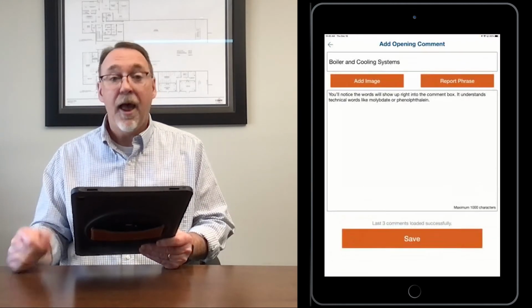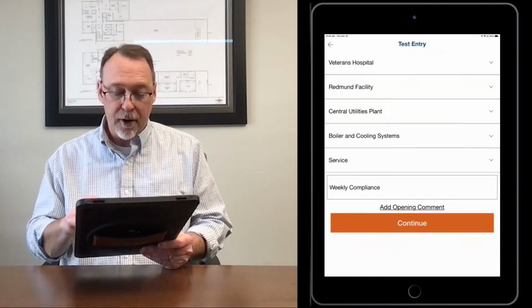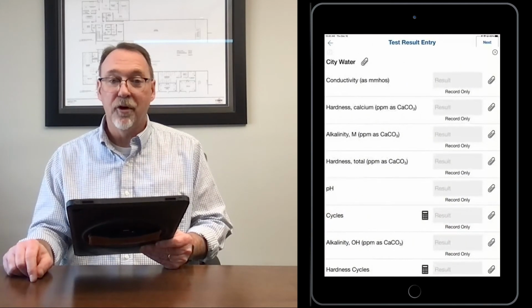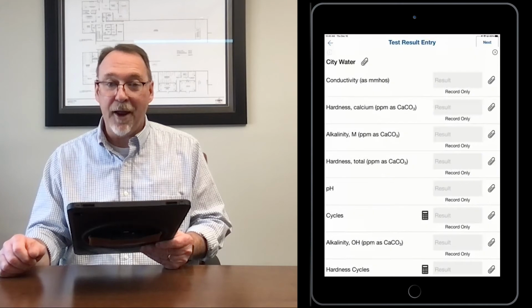Simply hit done, and it adds the comments to your report. Save it, continue, and you're ready to start collecting your results. Hopefully this helps speed up your day.